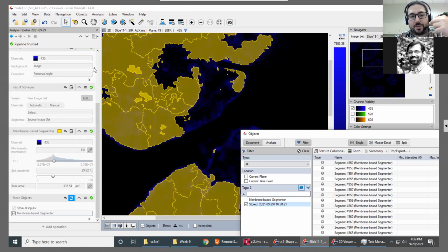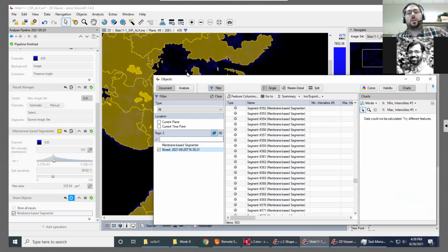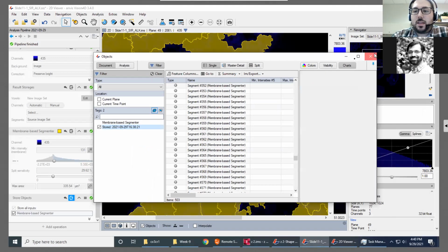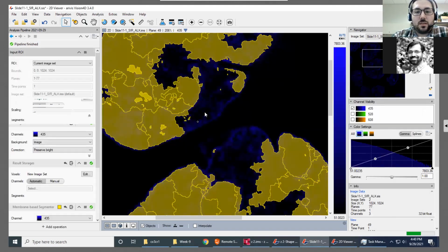So that's a kind of iterative process that, using these kinds of tools, you might go through several iterations to find a good model or do the right kind of deep learning on your data set to make sure that the algorithms in the program get you the results that you are looking for, or analyze it rigorously and confidently. So that's example one.